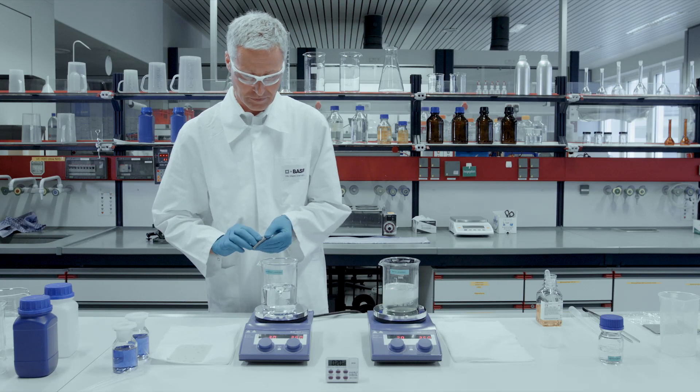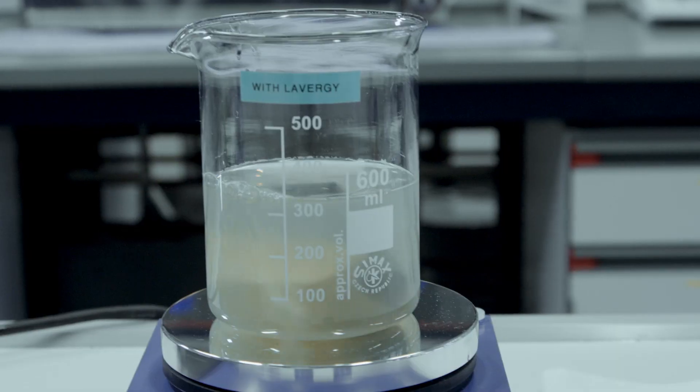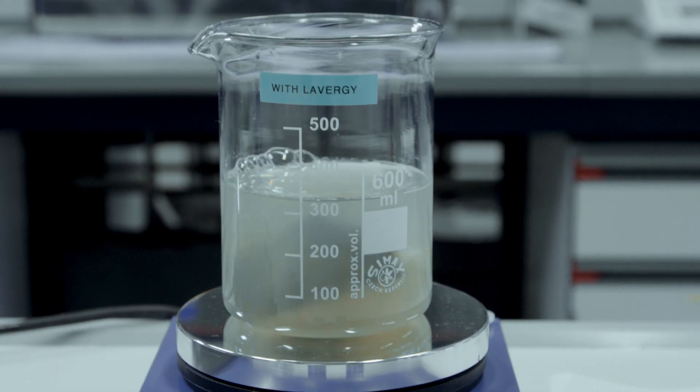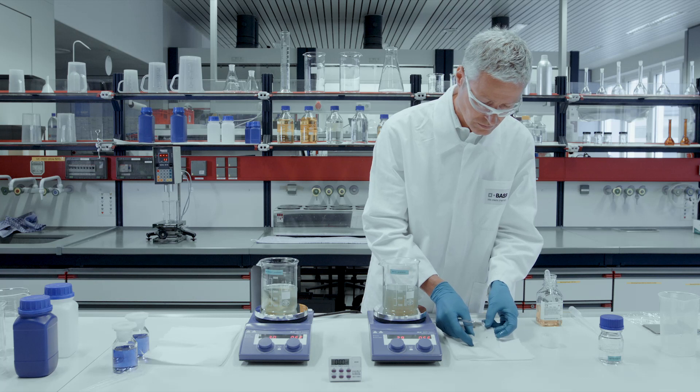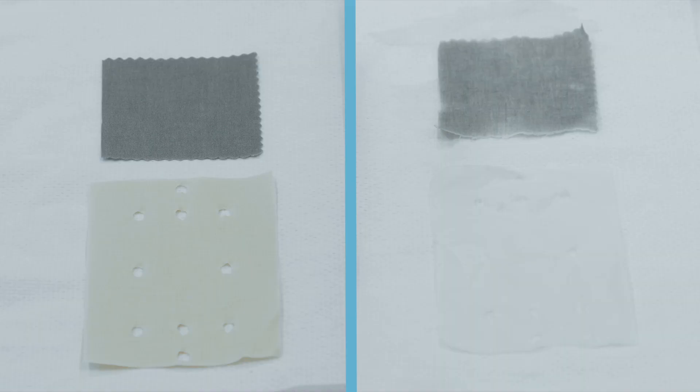Fabrics stained with grass and egg are put in the liquid. The stained fabrics soaked in the liquids are stirred for 20 minutes and then hung out to dry. The result for the fabric treated with Lavergy Pro is clearly better performance.